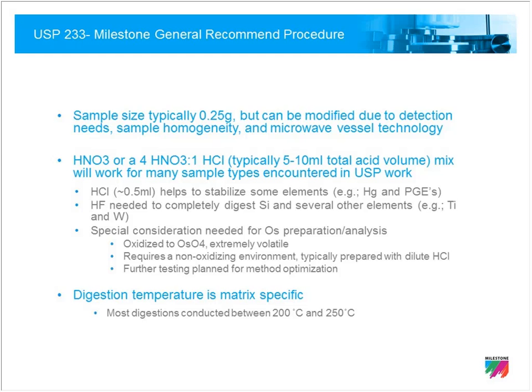Not necessarily because it's going to help with the actual digestion of the sample, but because it's there to help stabilize certain elements. Mercury, platinum group elements, etc., really benefit from having some chlorine in the solution. In regards to HF, unfortunately, it doesn't matter how high a temperature we go inside of a microwave. Chemistry is still chemistry.